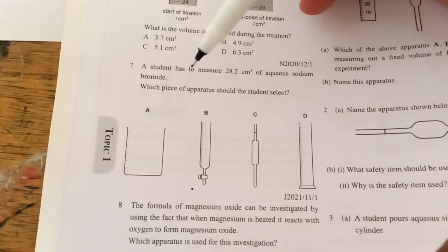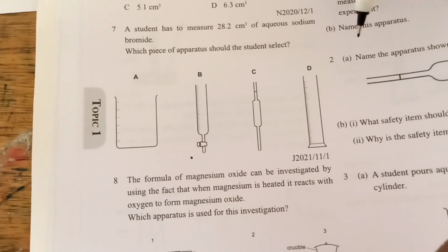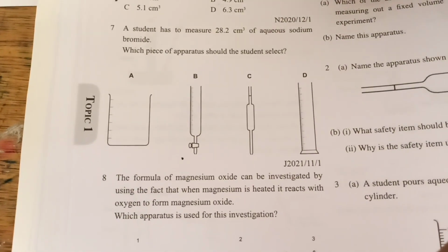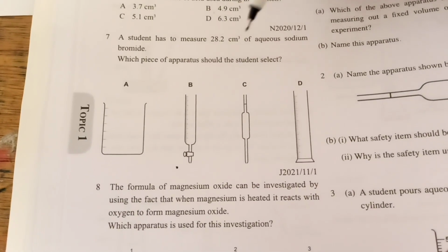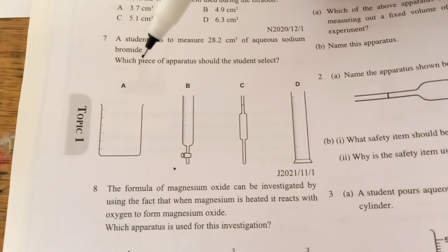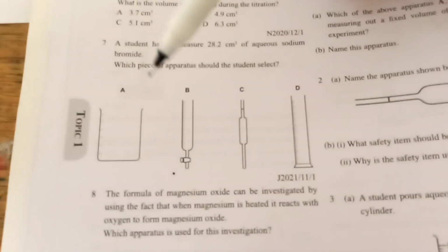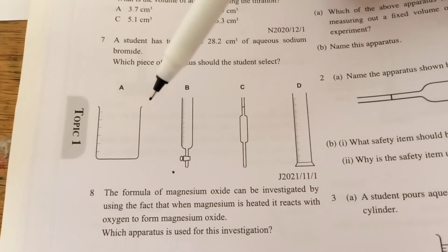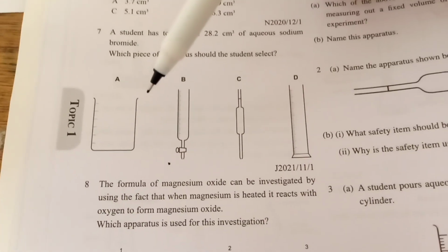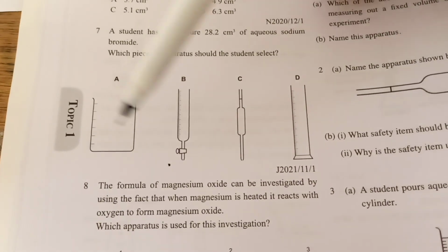Now try this question first. Stop the video and try it. A student has to measure 28.2 cm³ of sodium bromide. What is the piece of apparatus? You know, we can use this to measure 28.2, but it is not precise. In science, scientists always tend to be precise. So we cannot use this.